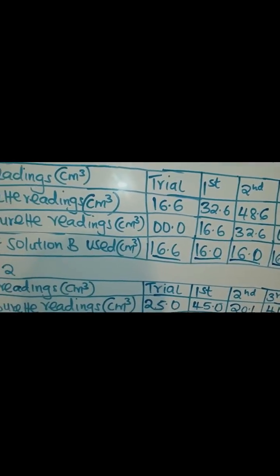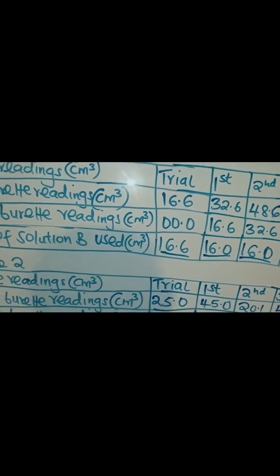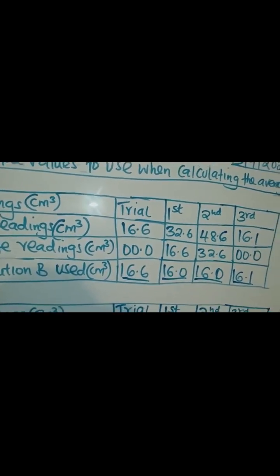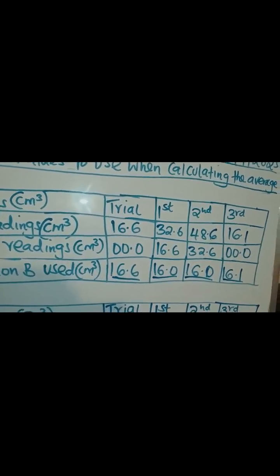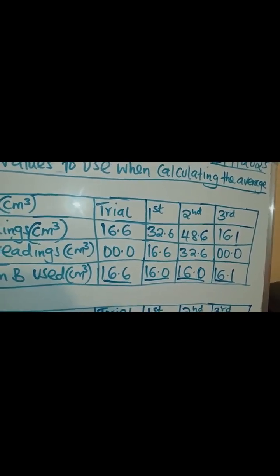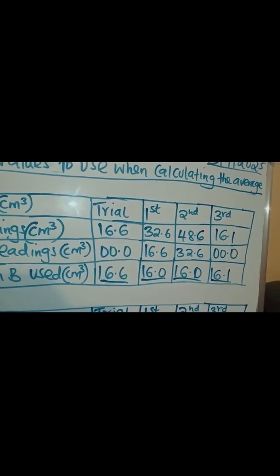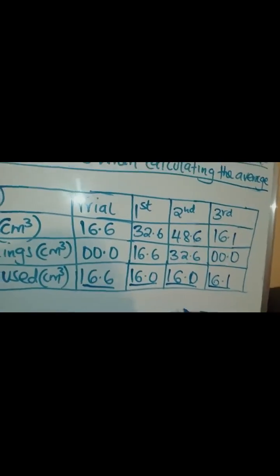In that point that we talked about in the previous video about the principles of averaging, it was explaining to us that we only take those values that have a difference from one value to the next of either plus or minus 0.1 or plus or minus 0.2.